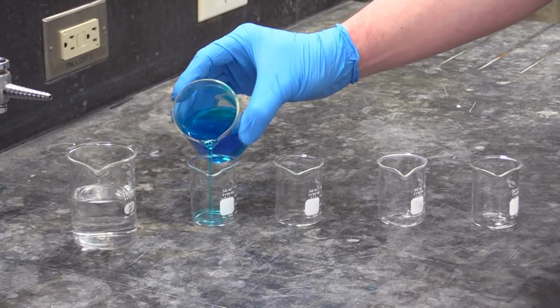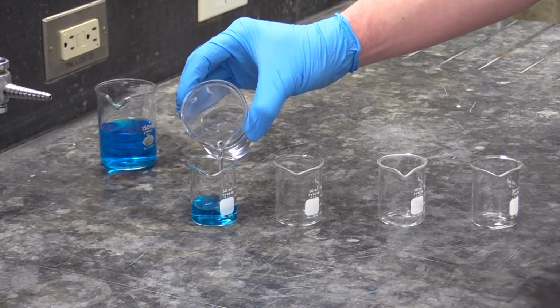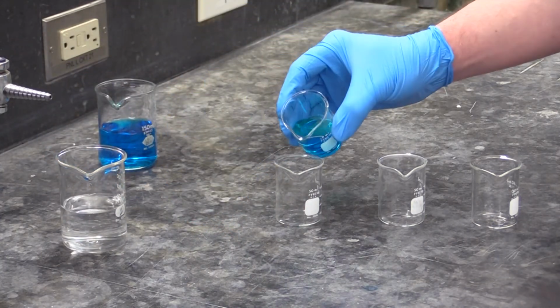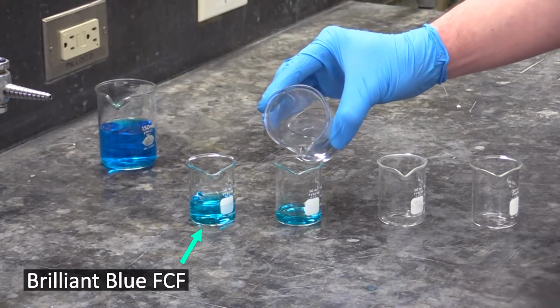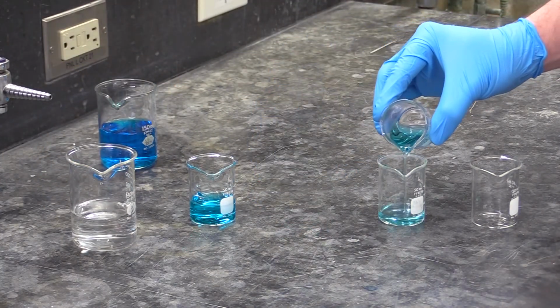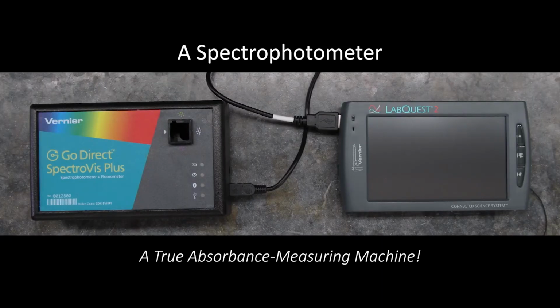So now that you know how to use the glassware pieces you'll be working with, let's go over what you'll be doing with them. You are going to use each piece to make a series of solutions of brilliant blue FCF dye, with each solution in the series made to a different concentration. You will then use one of these here fancy devices, a spectrophotometer, to measure how much light each solution absorbs. The more concentrated they are, the higher their absorbance will be.